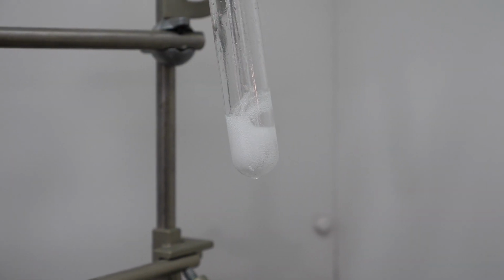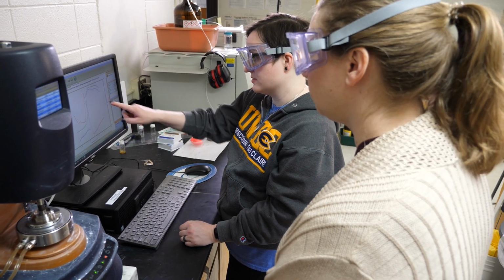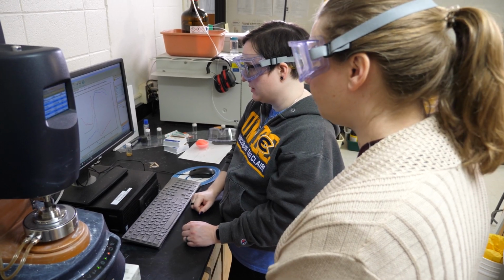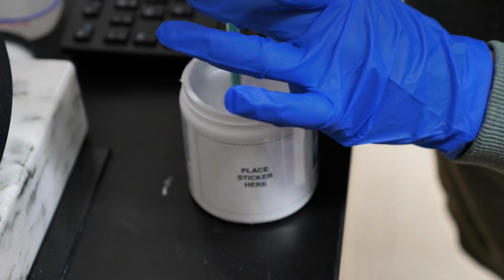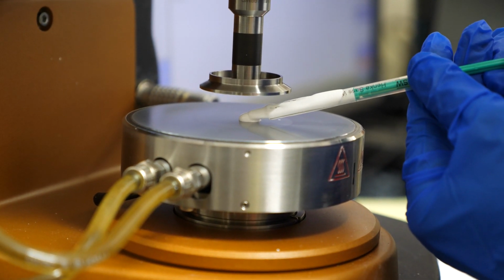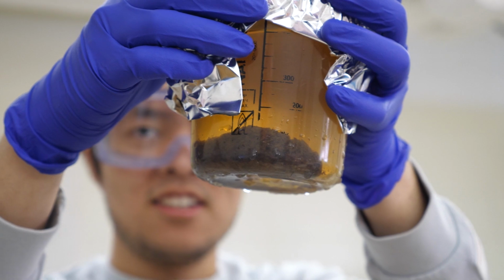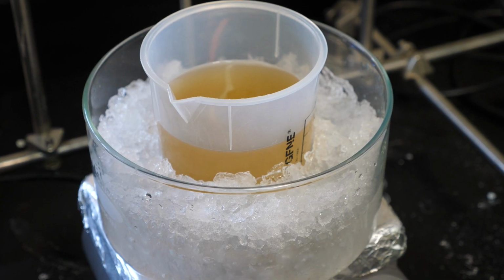So by doing the viscoelastic work, in addition to all of the other characterization work we're doing, we can create a library of the different properties of each of these polymers, and we can use that information to decide what would be best for a particular application, or something that's working really well but isn't quite where we want it. We can be like, oh, well, we can synthesize something that's a little bit different and it might have better properties, but you need somewhere to jump off from. And having all of this information that we're collecting with the different characterization methods helps us make better decisions about where we want to go.